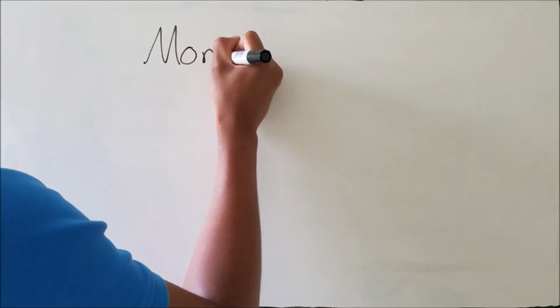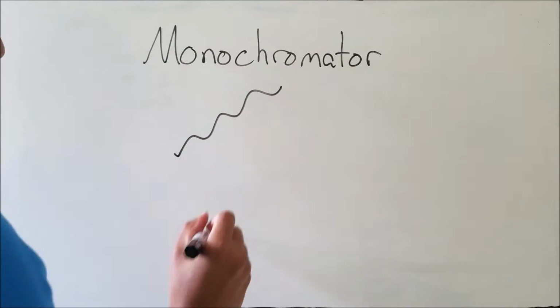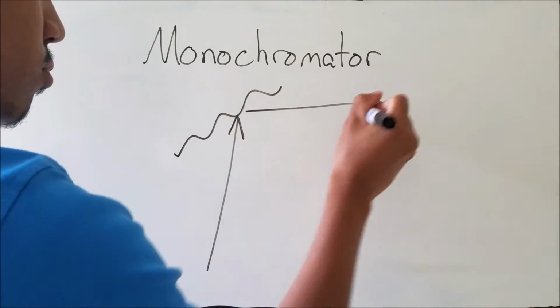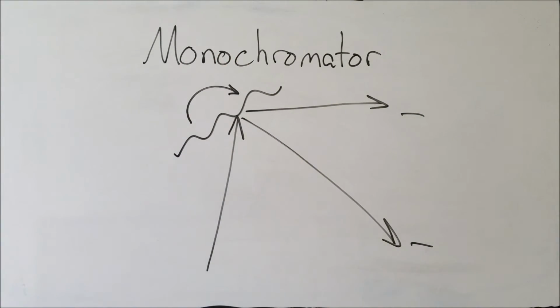The monochromator is a device that, once light has entered, has a grating inside that changes the angle and thus changes the wavelength of the outcoming source. We can select what wavelength we want. This then gets sent into the microscope to excite the sample through another series of collimation seen in the short video following.